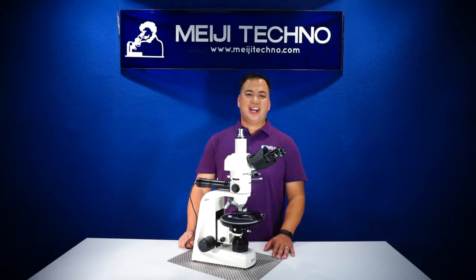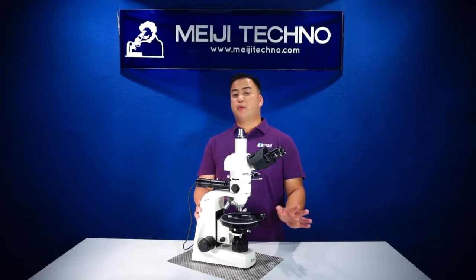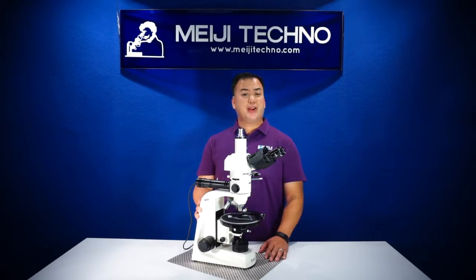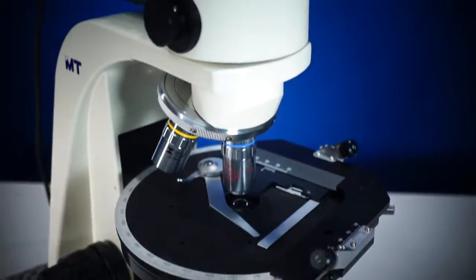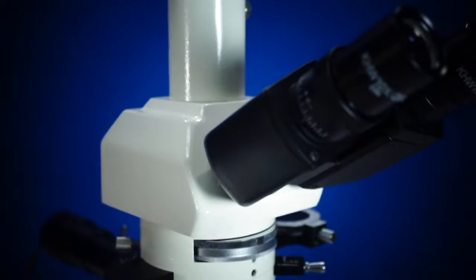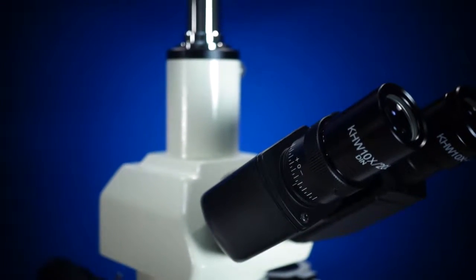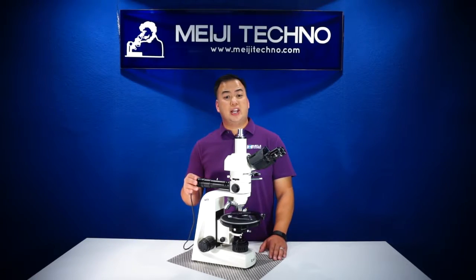Our MT9900 series is our most popular transmitted and incident illumination polarizing microscopes from our professional grade of petrographic microscope. It has all the higher components that one will need for a high-end petrographic system. The MT9900 series is a suitable instrument for most applications that might require transmitted and incident illumination.